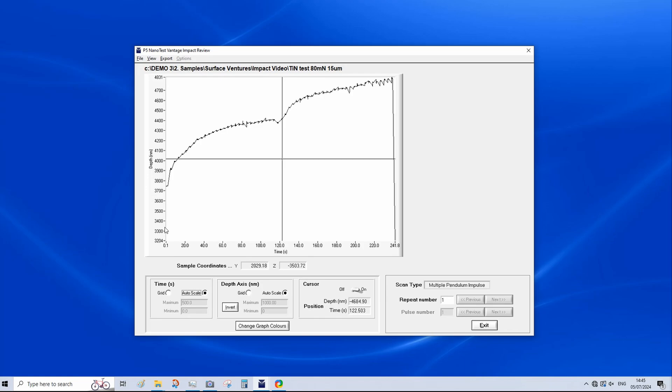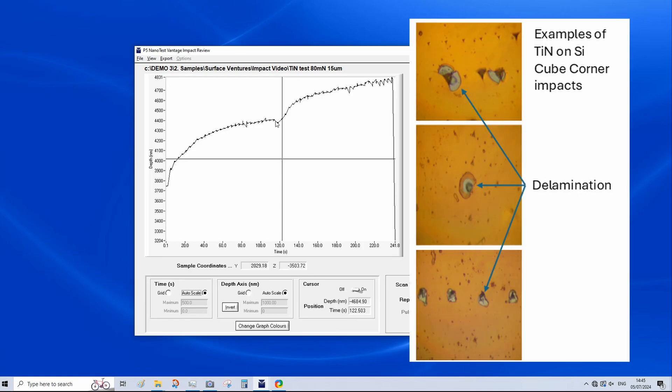So as you can see on our titanium nitride coating, we have an initial depth here of just over 3.7 microns. We are then getting deeper and deeper into the coating system until we have our dramatic failure. So you can see here this reduction in depth is likely some debris sitting in the impact site. And we can then see a much more rapid increase in depth as we've broken through the coating with our sharp cube corner indenter. And we are now impacting into the substrate.